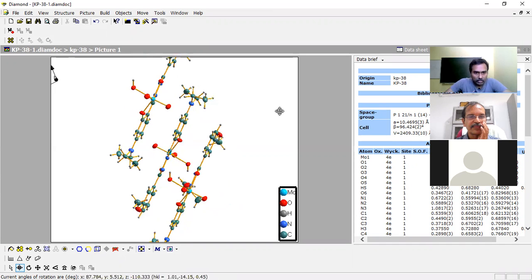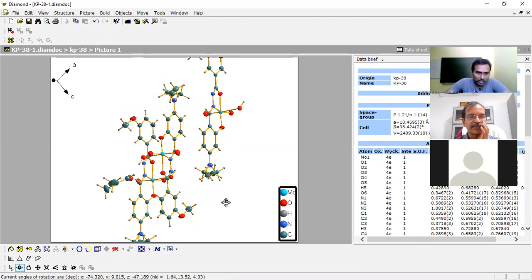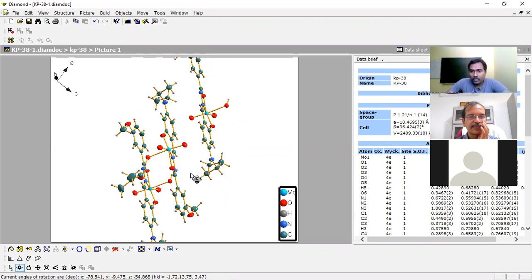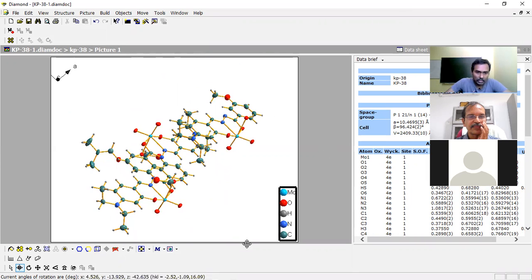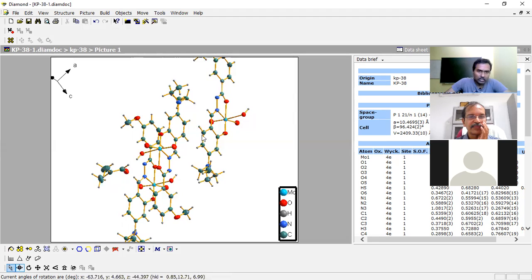before we draw this one, I have already got this molecule. We must know how to get the other molecules. When you open the zip file, only one asymmetric part will come here, the one molecule with this solvent we had, but additionally I got two other molecules. So I deleted them, and I will show you how to get this.